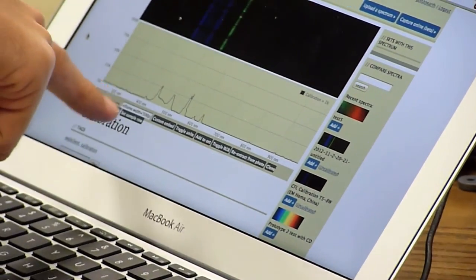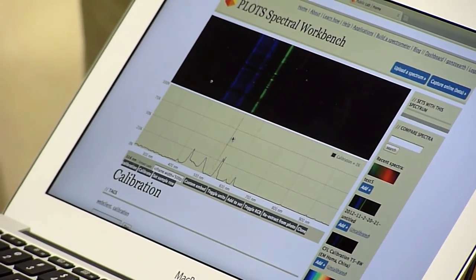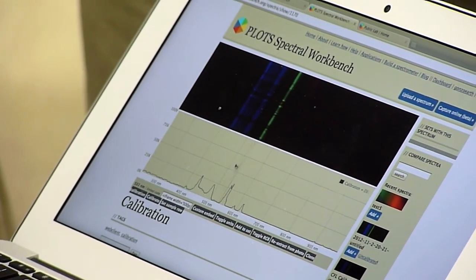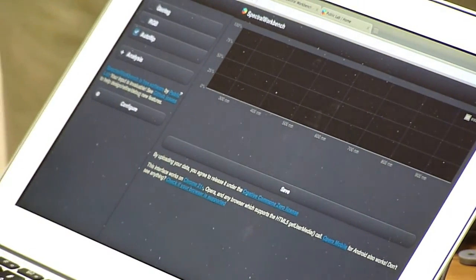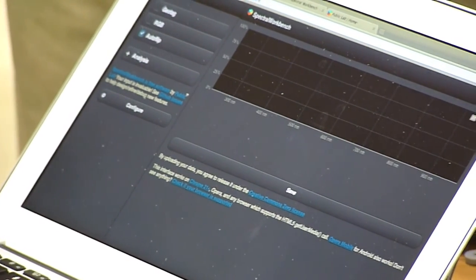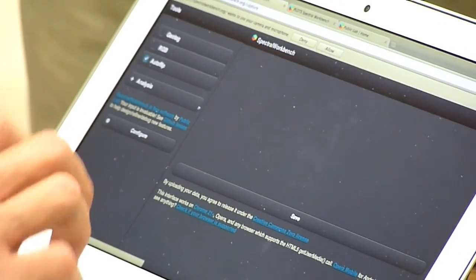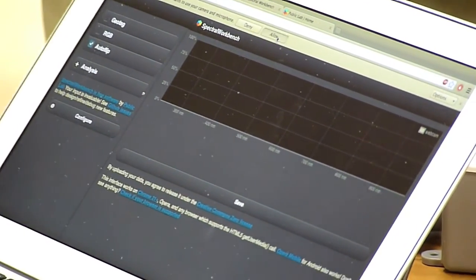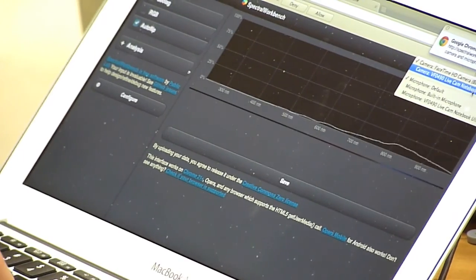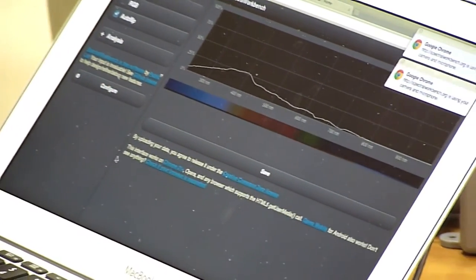So it shows you the exact nanometer wavelength along this, and you can move your cursor and see everything. Very cool. And now when we go back to this online thing and refresh it, I think actually something weird. This connection to the webcam is a totally new feature. So yeah, we'll say allow. It's annoying, but hardly necessary. And you notice now it's calibrated.